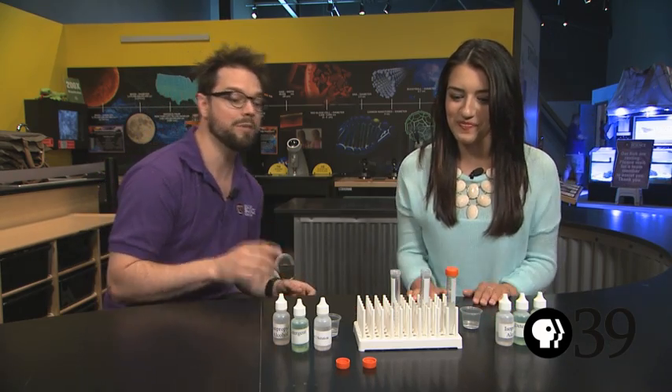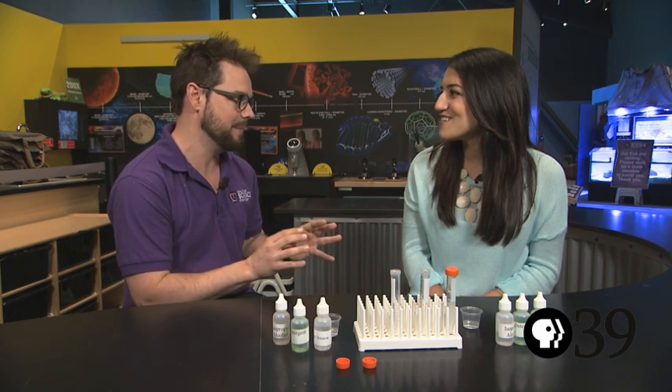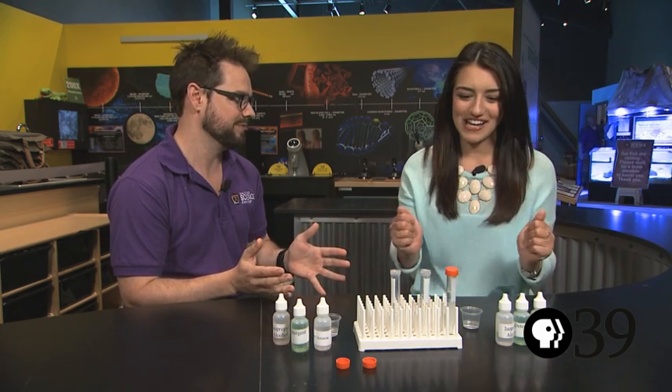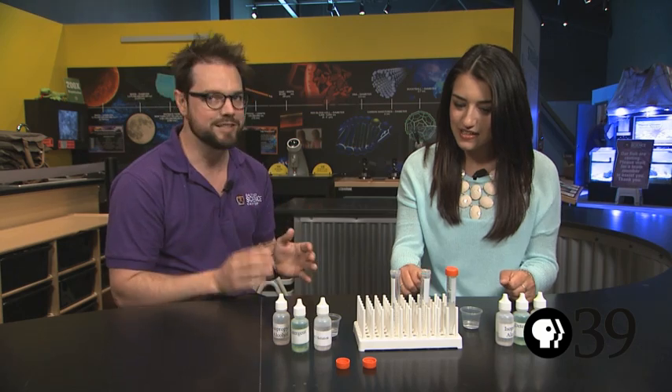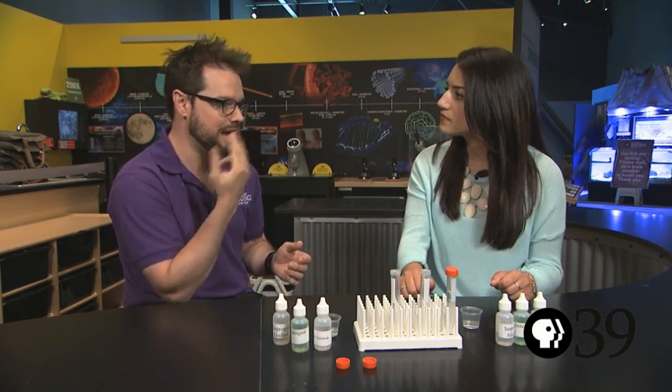And so what are we doing here today? What I'm going to do is we're going to extract some DNA out of cells from your body and see whether we can see it. We're going to get it from cheek cells. Cheeks are lined with skin and they shed cells into the saliva in your mouth.